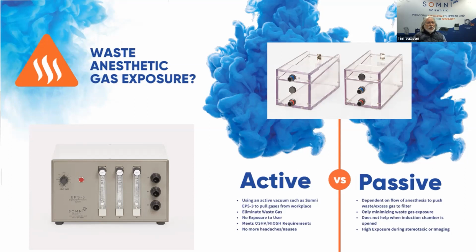The downside to this is the gas always takes the path of least resistance, which is typically not through a small tube and then getting pushed through a charcoal filter, but around any unsealed areas of a nose cone or the induction chamber, especially when you open the induction chamber to bring the animals in and out. So there's quite a bit of exposure trying to use a passive system.